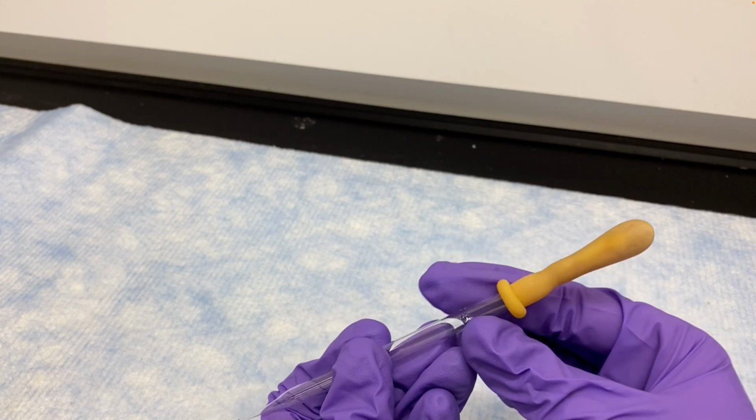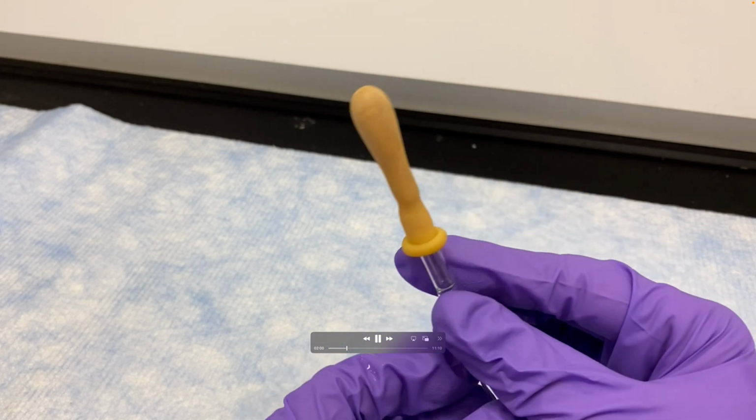When you attach a bulb to a Pasteur pipette, like you can see here, push down on this thick part of the bulb. That's where you want to put your fingers and push it down into this. If you don't do that, it can be a little hard to get that to attach.